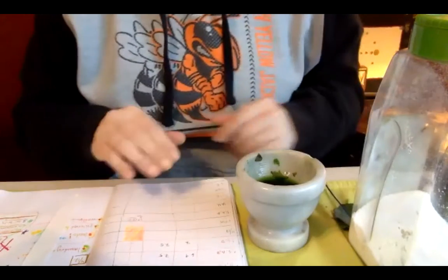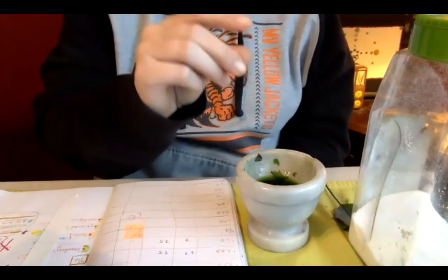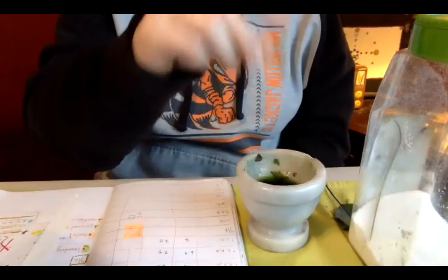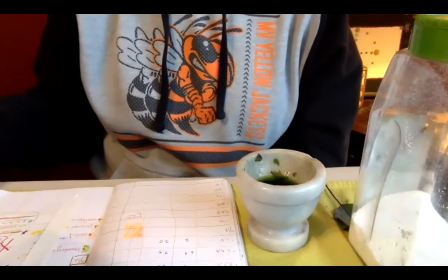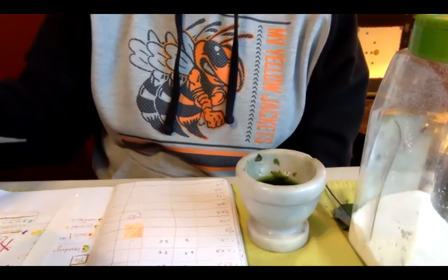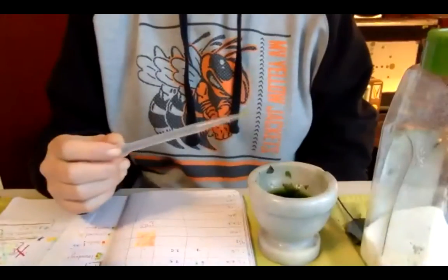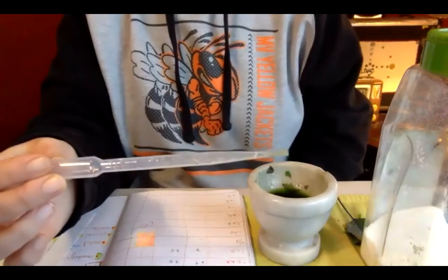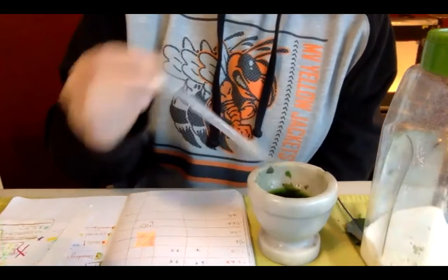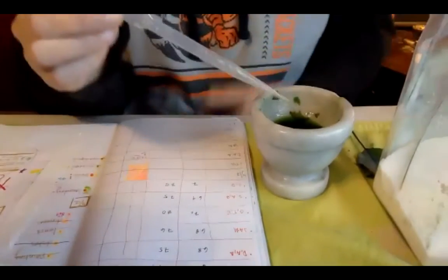We're supposed to use a capillary tube. Anyone who's ever used a straw to drop water or hold it so you can flick it at somebody, same concept. We're using basically water surface tension and adhesion properties to climb the wall. You probably don't have a capillary tube sitting around at home. That's okay, I actually didn't. I thought I'd find something a little better than this, but I just happened to grab these transfer pipettes. So I'm just going to use that, but even a coffee stirrer would work for this job. And the narrower, the smaller diameter, the better.